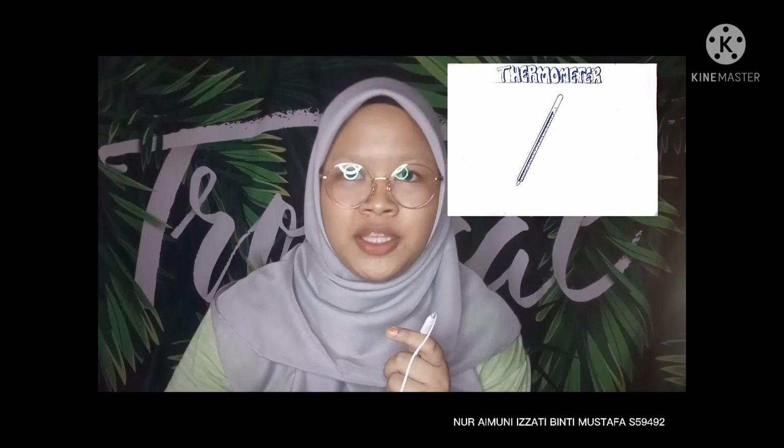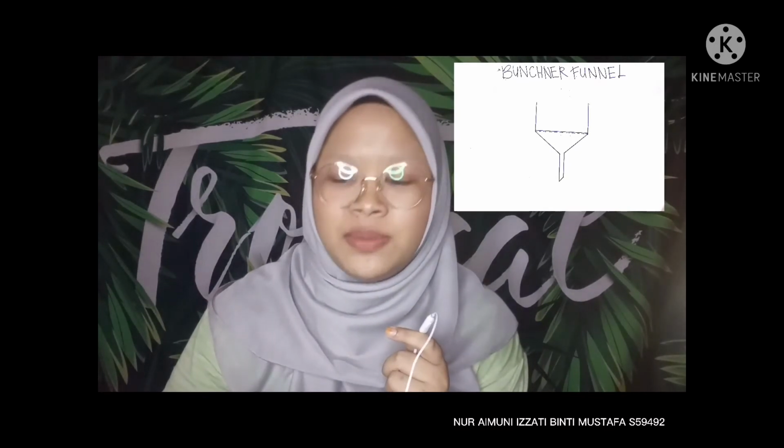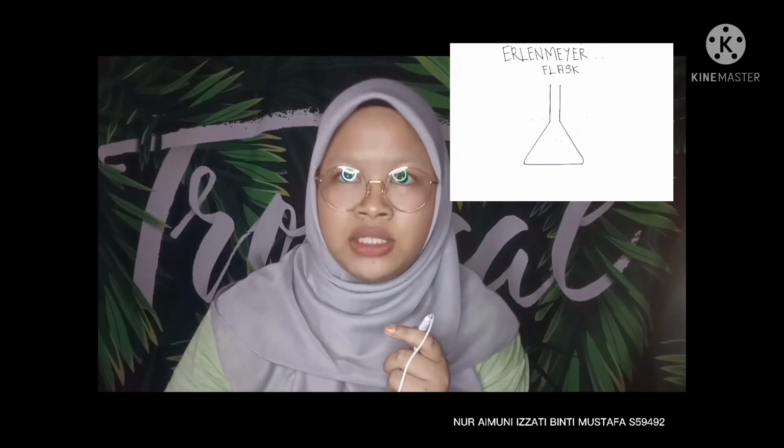Apparatus used in this experiment is the thermometer. Thermometer is used to measure temperature. Then, Buchner funnel. Buchner funnel is used for filtration and separation of liquid substance. And Erlenmeyer flask. Erlenmeyer flask is used to make a solution, such as holding, containing, collecting, or sometimes volumetrically measuring chemical samples or solutions.